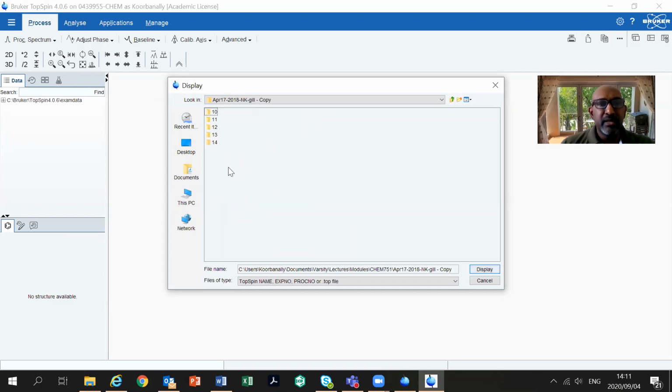We looked at these 5 experiments yesterday. Keep in mind that experiment 10 had the carbon-13 NMR spectrum and experiment 11 had the proton NMR spectrum. We stopped there, so we analyzed 10 and 11, and we got a good grasp on how to analyze 1D NMR spectra.